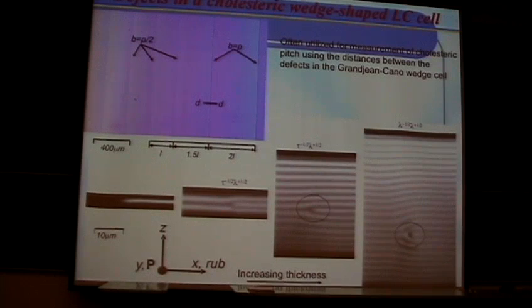However, if we wanted to visualize the actual director structure behind those lines, it would be very challenging, although this has been done before using just polarizing microscopy textures of this kind and some understanding of structural organization of liquid crystals. Now, if we use fluorescence confocal polarizing microscopy, the nature of those lines, those defects, can be visualized very directly. The images I've shown here correspond to different lines as one goes from the thinner to the thicker part of the sample.